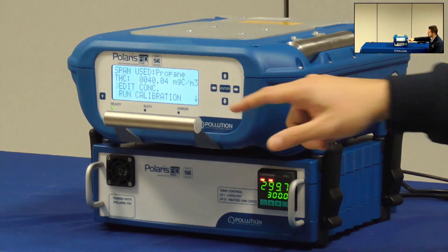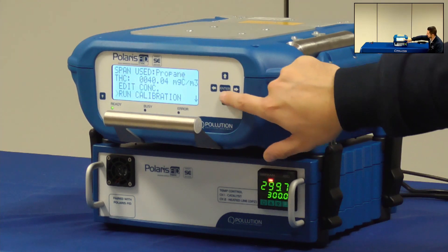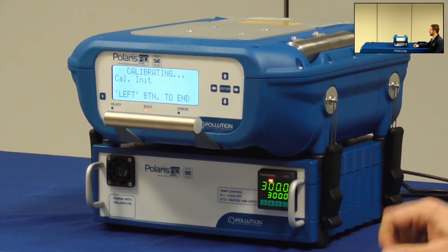If necessary I can change the span gas concentration and finally I select Run Calibration. Now the instrument will start analyzing the span and on the display will appear the values of the area below the FID peak, which is correlated to the carbon concentration in the span gas.